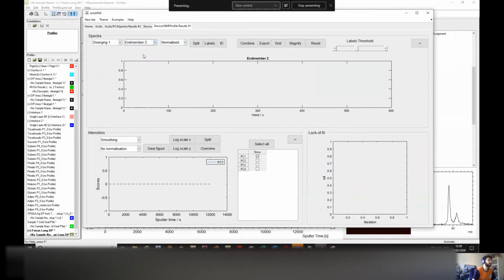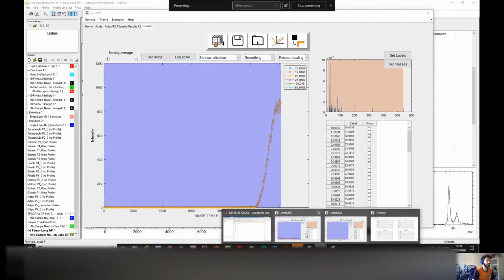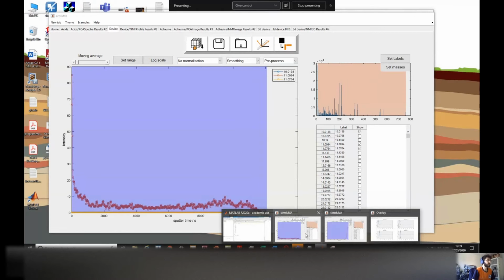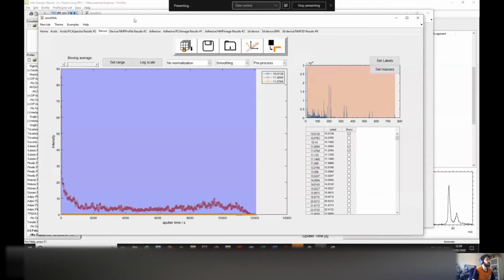Yeah, there was something weird with that. Maybe because I didn't normalize by total before. I have a backup. I loaded before with more peaks. It's just that it's too heavy to load with more peaks and it takes longer to export, so I didn't want to waste all the time waiting for it to export. But once you have a longer list and import it with the proper normalization, that's what you get. It's just a much longer list.